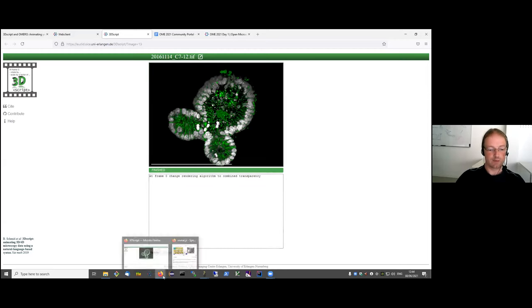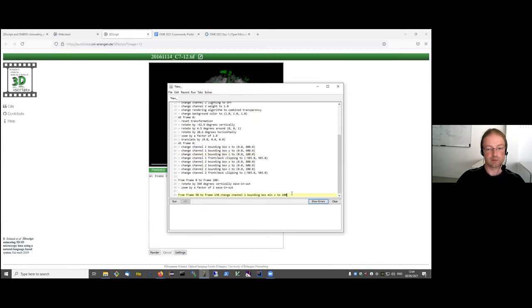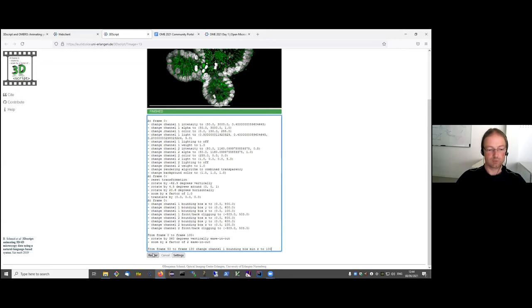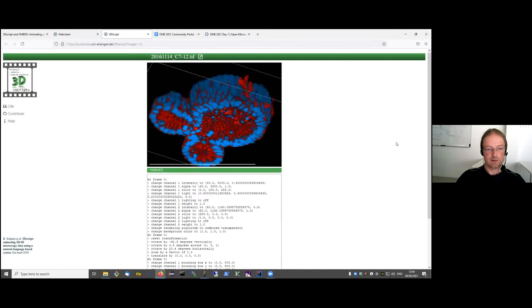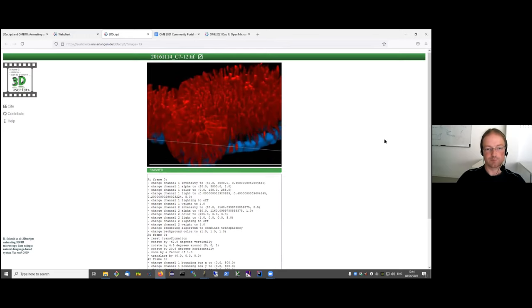Of course, I can also go back to my Fiji text, which I created before, and just copy it and paste it in here. And ideally, I would hope now that I get the very same video, and I hope that's also what I can show you. So it's doing it. And you see it looks exactly the same because it's using the same text and it's fully reproducible.